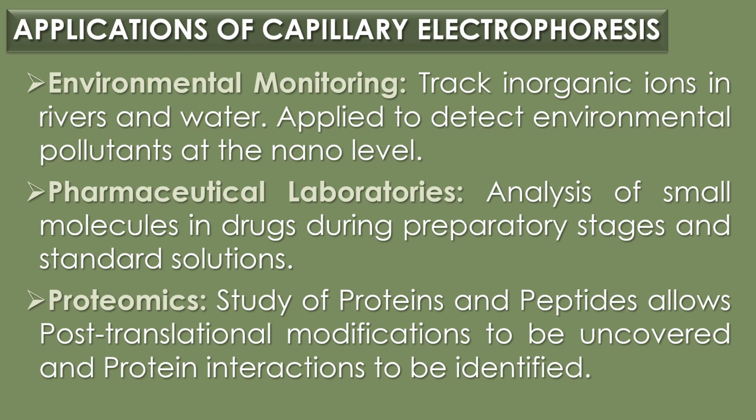The fifth application is pharmaceutical laboratories. Capillary electrophoresis is used in the analysis of small molecules in drugs during preparatory stages and standard solutions. The sixth application is proteomics. Capillary electrophoresis is applied to the study of proteins and peptides and allows post-translational modifications to be uncovered and protein interactions to be identified. This information contributes to the discovery of potential drug targets and disease biomarkers.